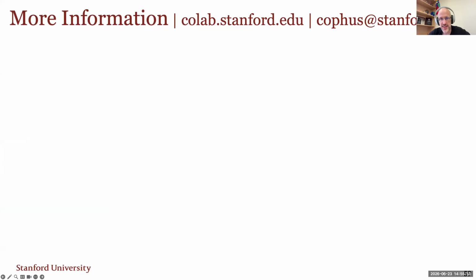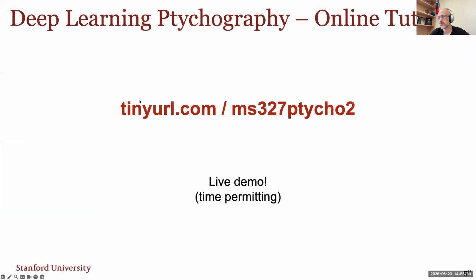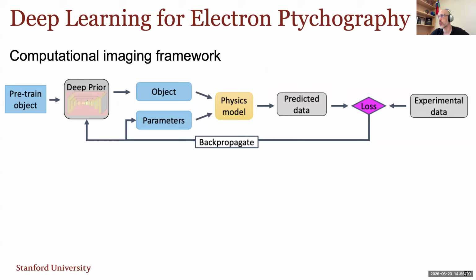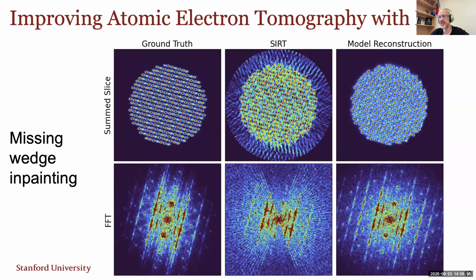Okay, question 1 in the chat. How about predicting the intensity values from missing wedge in 3D diffraction patterns? The answer is yes. So we are doing this already. This is called diffraction tomography or 6D crystallography or 5D STEM or 4D STEM plus micro ED. It basically works exactly the same.